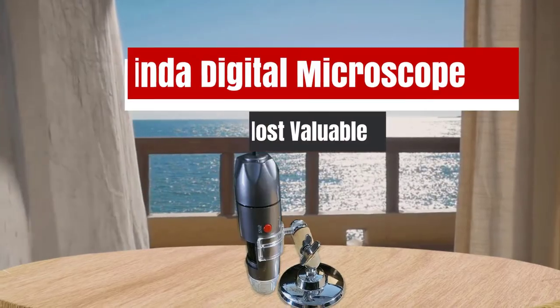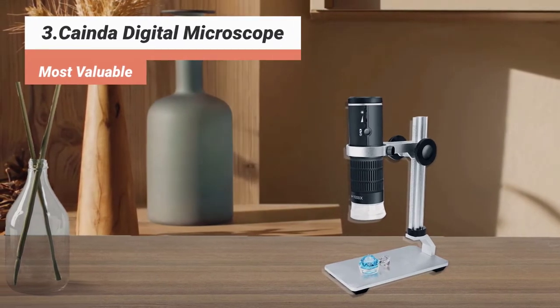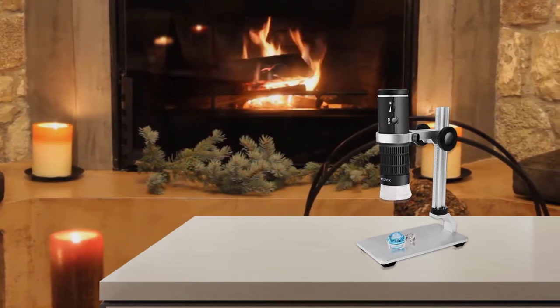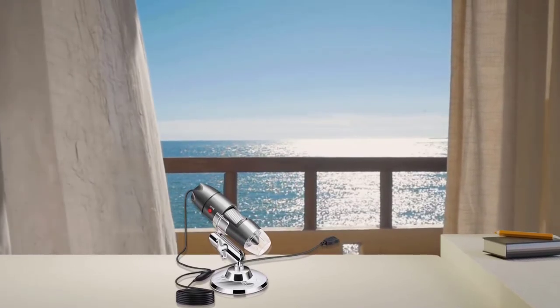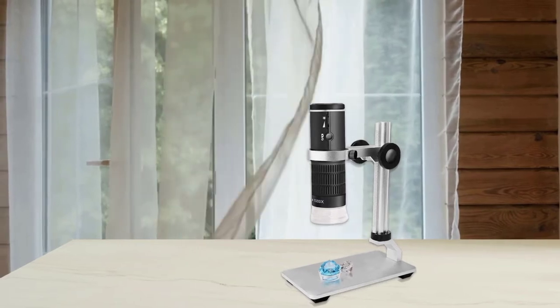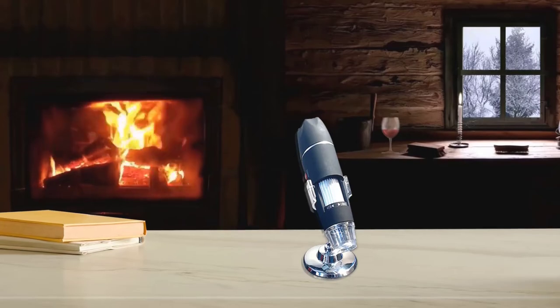The third product on our list: Kainda Digital Microscope, most valuable. All the convenience in one simple box — that's how Kainda packed their digital USB microscope. It comes with essential tools including 3-in-1 USB converters and CD drivers for plug-and-play use. Despite being comparatively big, it is very light, which is why most parents recommend it for their children. Made from metal, durability is not compromised. It can view objects at 1000x magnification, with clear image focus due to its 1mm to 90mm focus range.